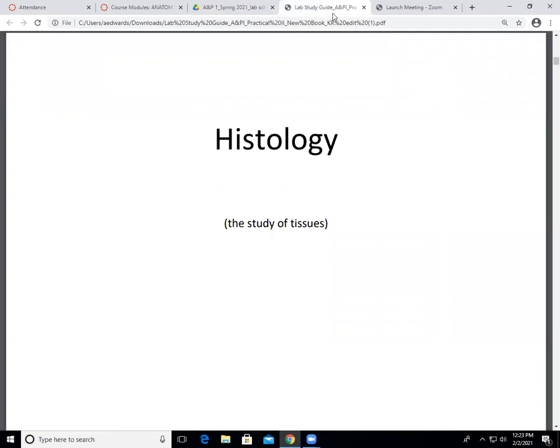So let's go ahead and get started with histology, which is the study of tissues. Okay, and this comes straight from your text, right? Or not from your text, but from the Canvas course, right?